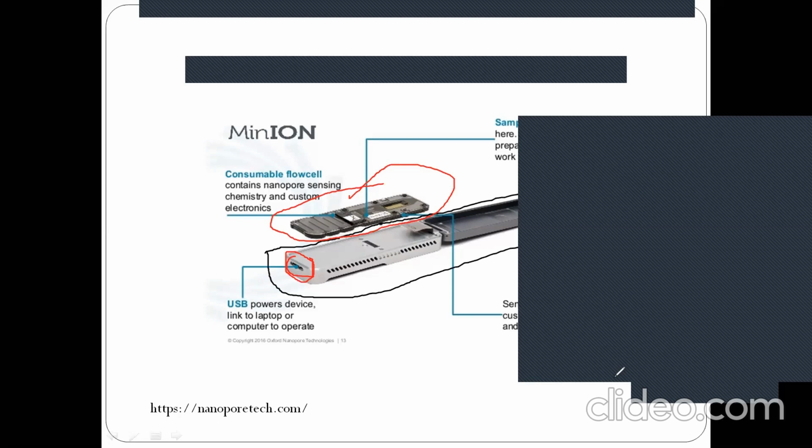But it's not a guarantee like when you purchase a TV and it malfunctions, and the company simply replaces it. They will only replace it after rigorous quality checking, to see whether in between each sample you ran, you actually performed adequate cleaning using their cleaning system.